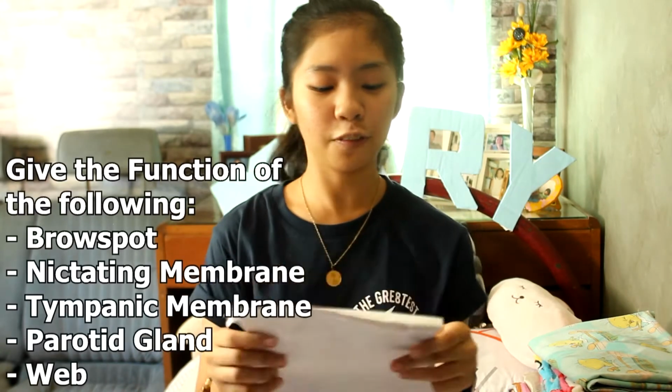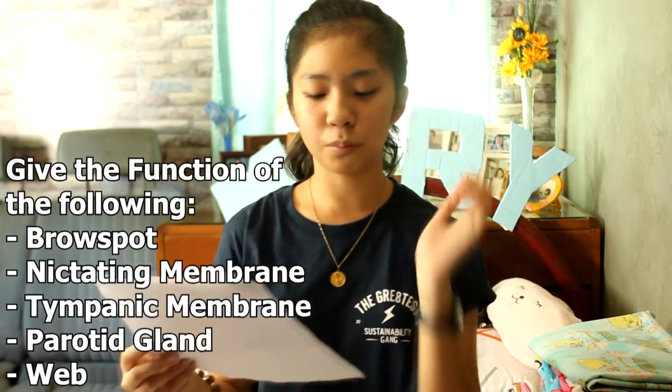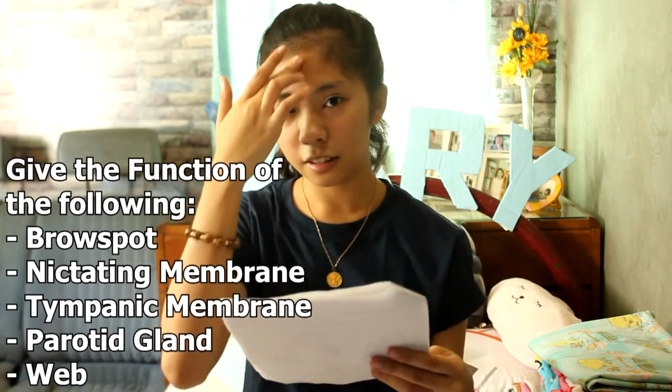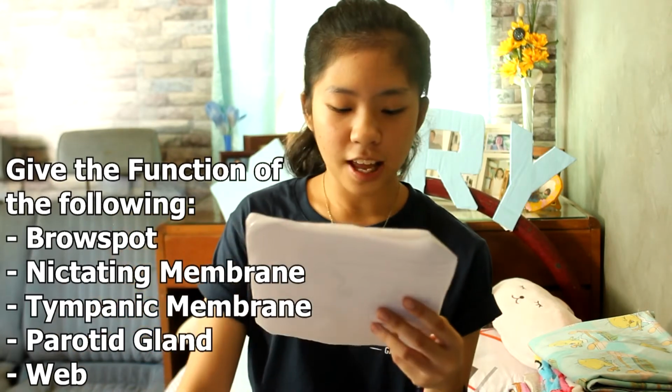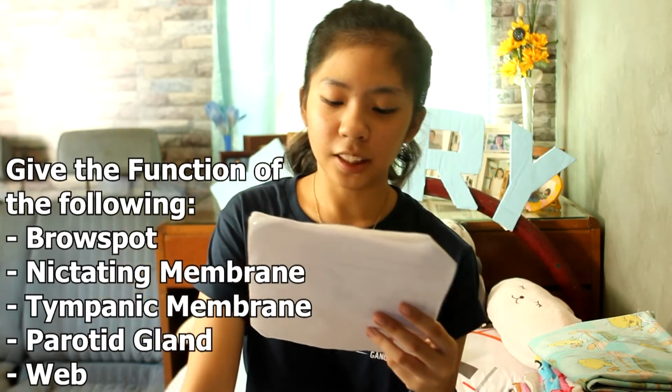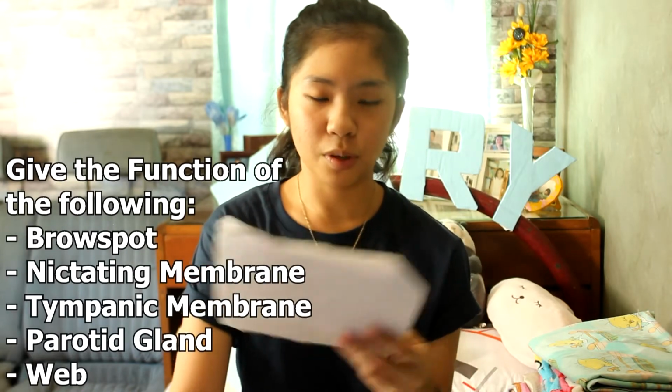Yes. Okay, next question is di siya question. It's to give the function of the following parts. So, katong brow spot, katong naa diri sa frog, it is distinct in frogs, and it is the vestigial eye represented by a white dot located between the eyeballs.